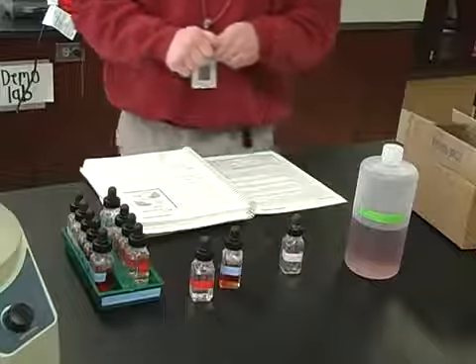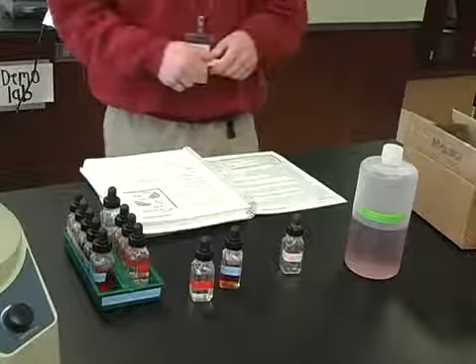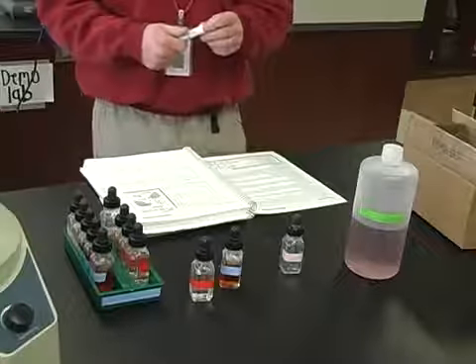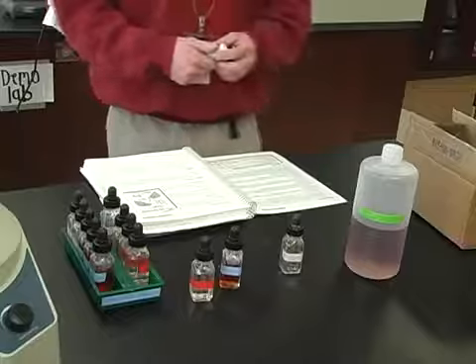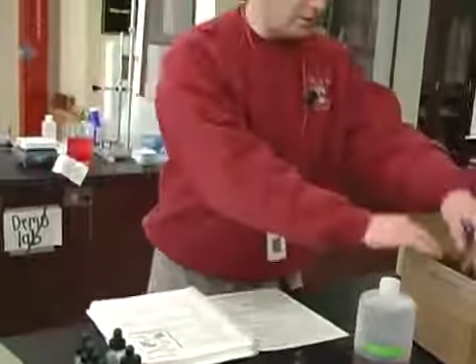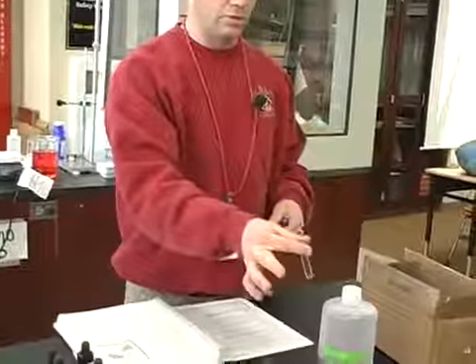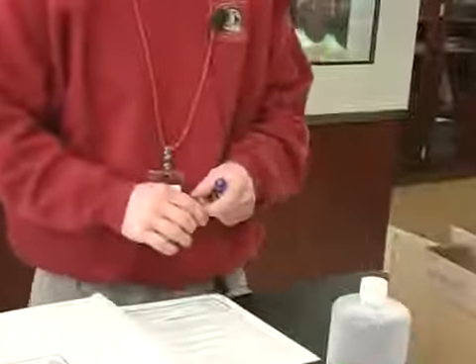I suggest using distilled water because then it doesn't leave scale on the inside of your glassware. And we only use a hot plate too, because then you don't have flames around either. With your test tubes, when you heat them, then you'll put it into a test tube holder, and then you just put that test tube into your hot water bath.